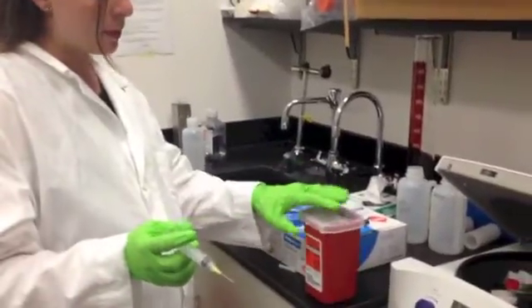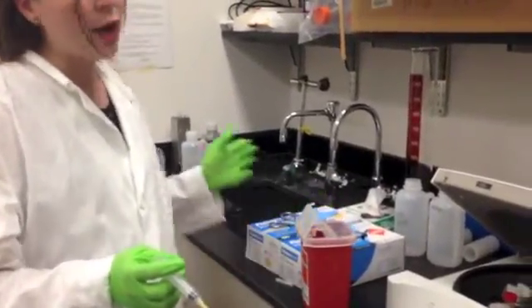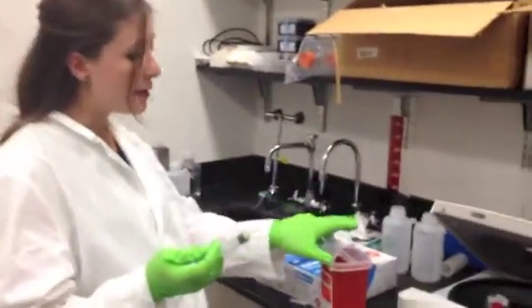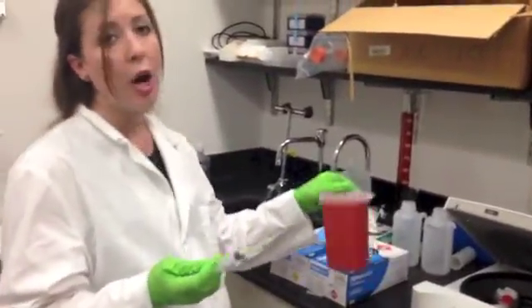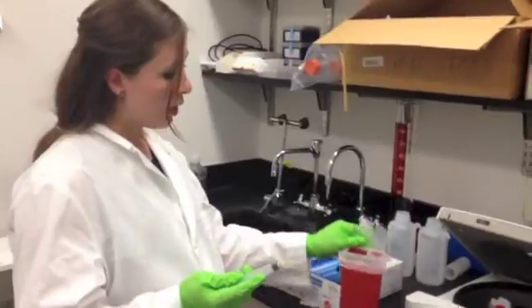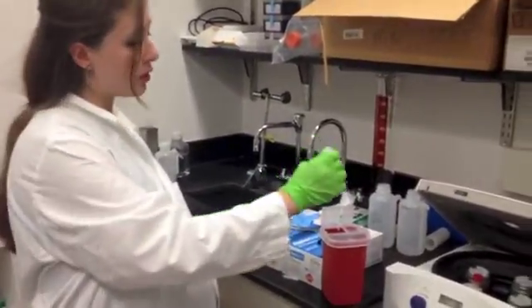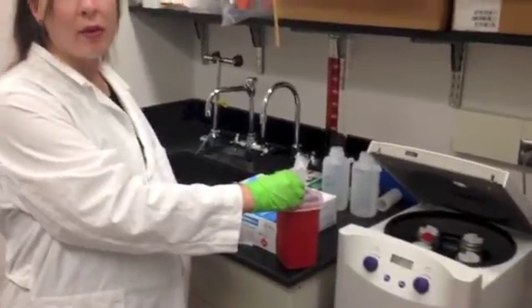You can see that I have my sharps bin right here, and it's not across the room. I don't need to walk around with an uncapped needle. It's literally right here, what we call within arm's reach. So you have your sharps bin wherever you need to be, and that uncapped needle just goes directly into the bin.